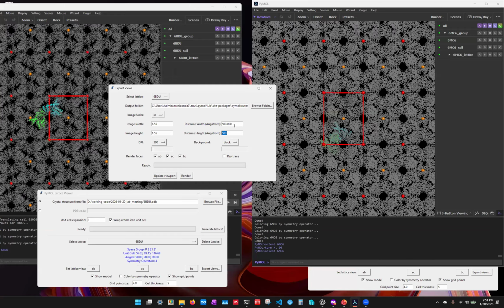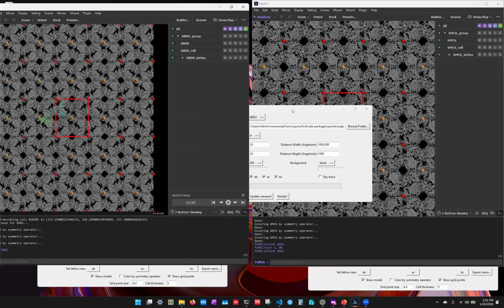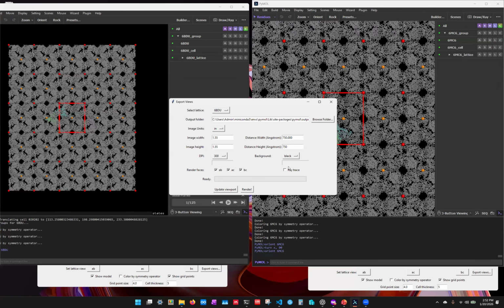Let me show you what I mean. If I click 1000 angstroms, it disappears for some reason. It's probably thinking. Oh, because it zoomed out way further than what's actually needed. Okay, let's just call it 750 then. Let's see that. There we go. So we'll say 750 angstroms.